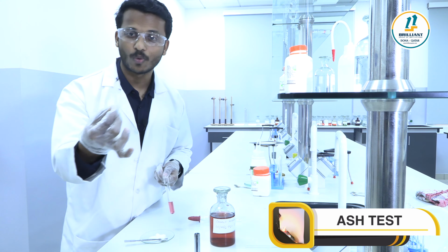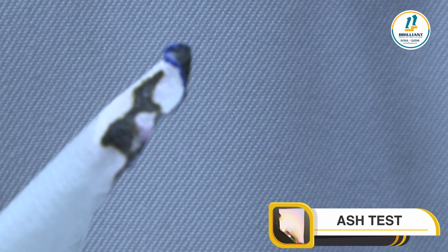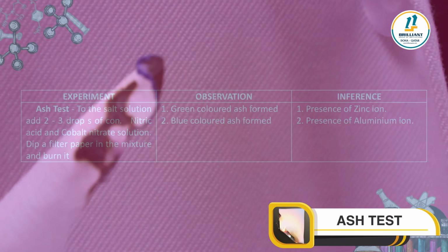Let me show you the color of this ash. Now you can see that this ash is green in color, which indicates the presence of zinc, Zn2+ cation. Now you can notice that the ash is blue in color, which indicates the presence of aluminium cation, Al3+.